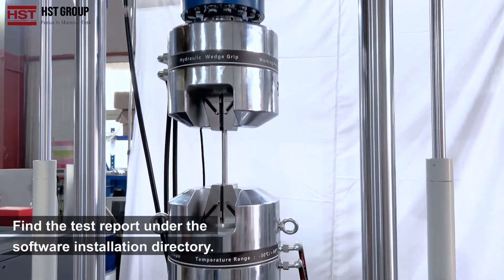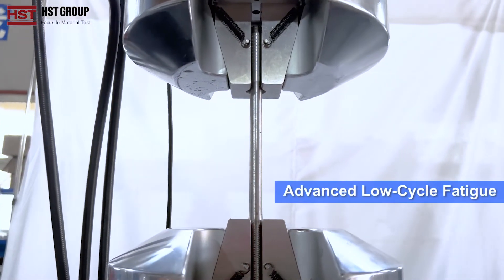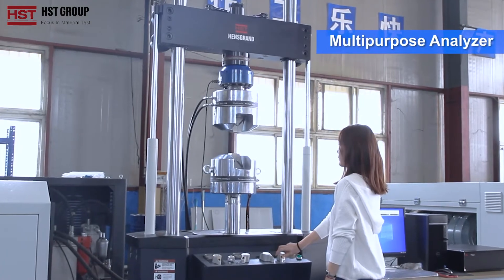Find the test report under the software installation directory. The machine supports low cycle fatigue, high cycle fatigue, advanced low cycle fatigue, advanced high cycle fatigue, thermomechanical fatigue, and a multi-purpose analyser.